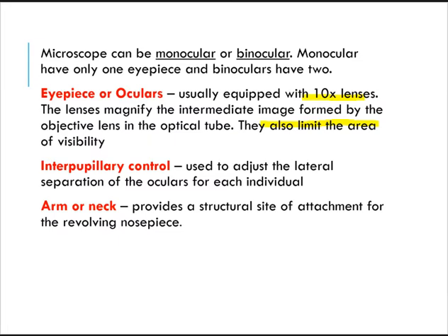So it actually leads to stress, like an ergonomic hazard, right? Putting unnecessary stress on parts of your body. Anyway, your interpupillary control should be properly adjusted to fit you comfortably.